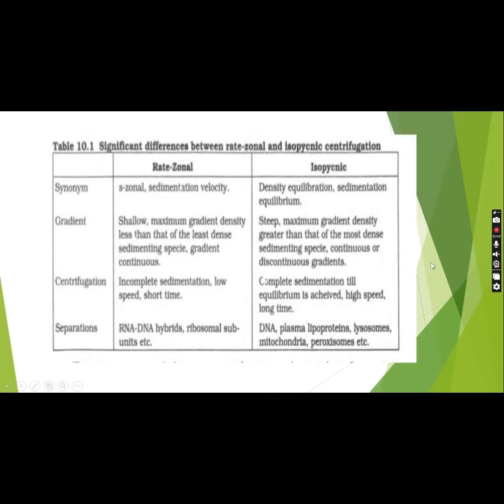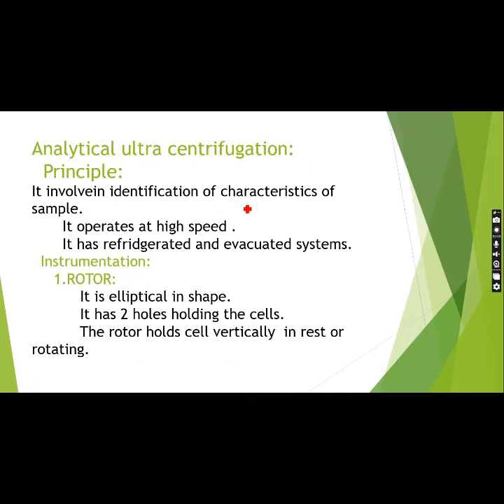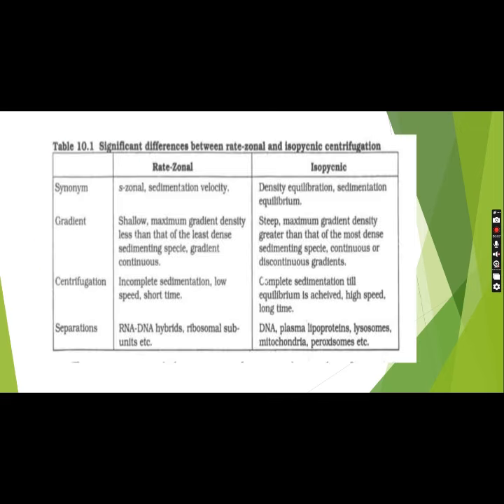In the case of rate-zonal centrifugation, it's going to use the sedimentation velocity principle only. But in the case of isopycnic centrifugation, from the name itself, we can say that same-density components are going to be separated off.